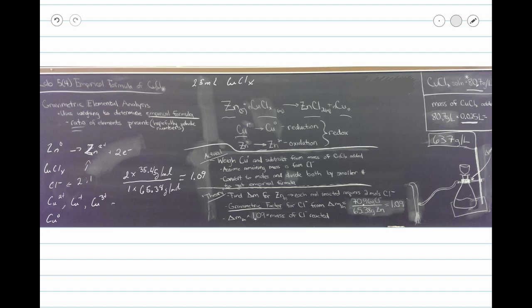By comparing the theoretical yield and the actual yield of copper you determined, you can determine the percent yield for your reaction. And there's nothing left to do but the experiment right now. We're going to show you how we set this up. There are a couple of notes that I want to share for when you do this yourself.